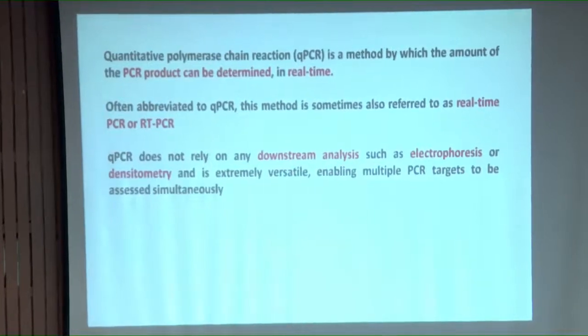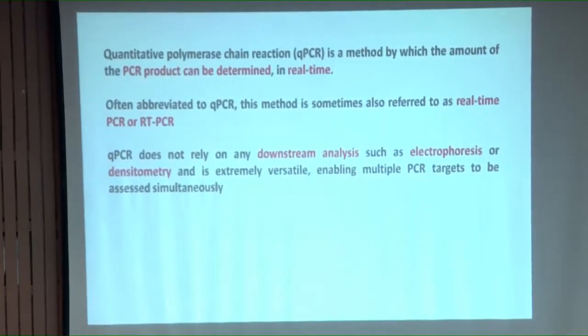qPCR does not rely on any downstream analysis, for example, electrophoresis, which I told. There is no need to perform electrophoresis to visualize the result, because from the first cycle itself, you start seeing whether the reaction is happening or not, right? Or the densitometry tools, just to confirm that the reactions have taken place or not. That is one. And it is very versatile, enabling multiple PCR targets to be assessed simultaneously, in particular what is called the TaqMan-based qPCR that we'll see when the slide comes.